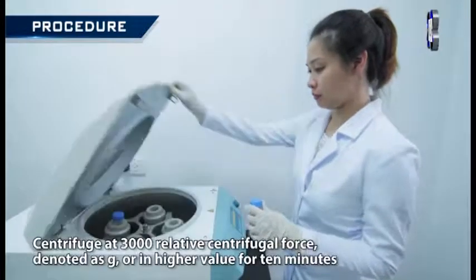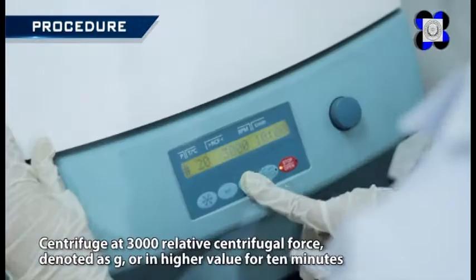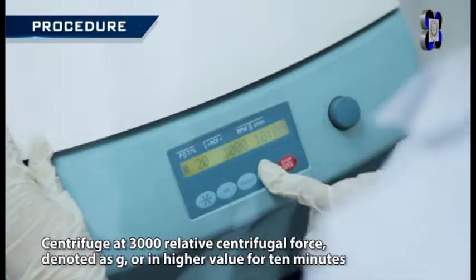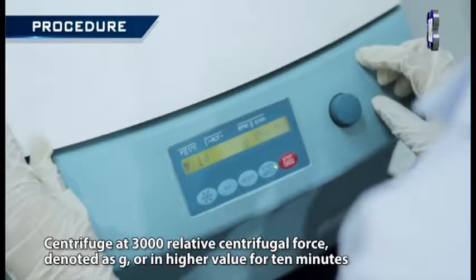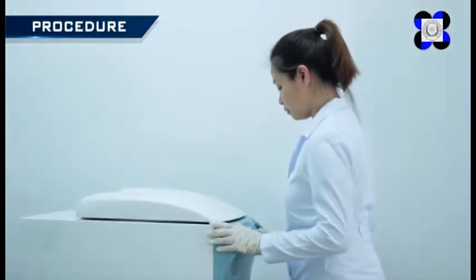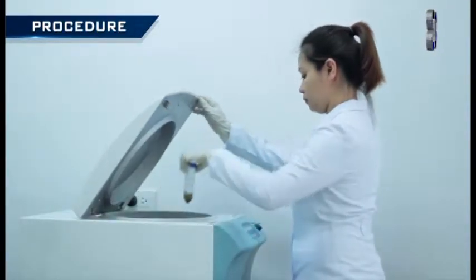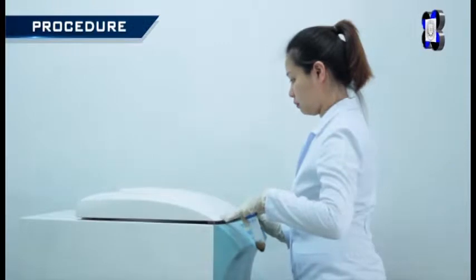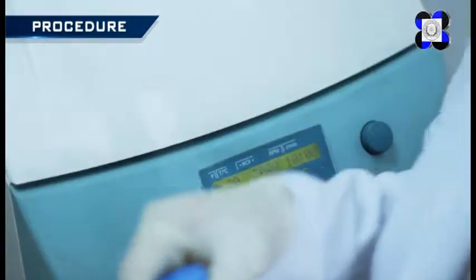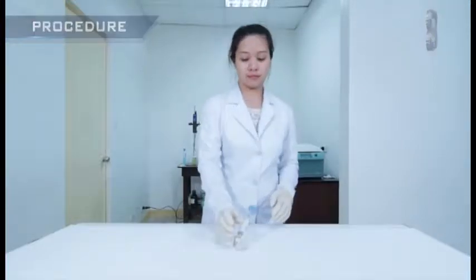Centrifuge at 3,000 relative centrifugal force (G) or higher for 10 minutes. Retain the clarified supernatant and transfer to a clean centrifuge tube. Store extracts at negative 20 degrees Celsius until tested with receptor binding assay.